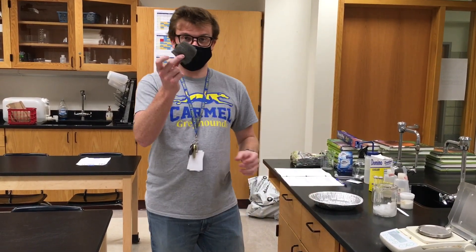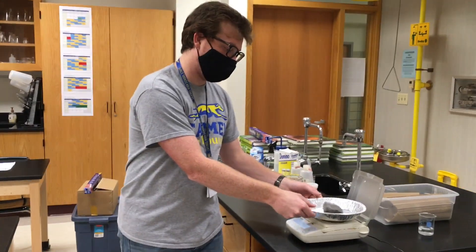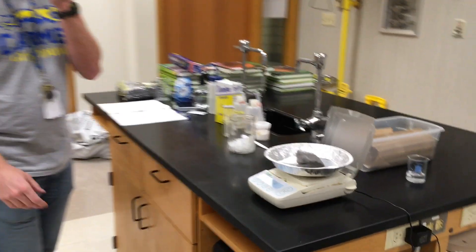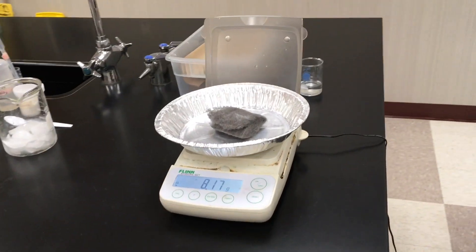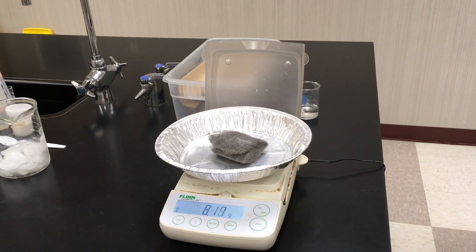So what we have here is a bundle of steel wool. I'm just going to throw that into my dish and then we are going to find the mass. This will be our very first data point. The steel wool at the beginning has a mass of 8.17 grams.